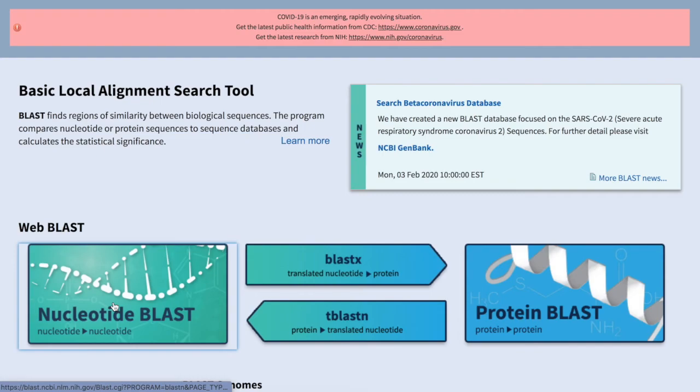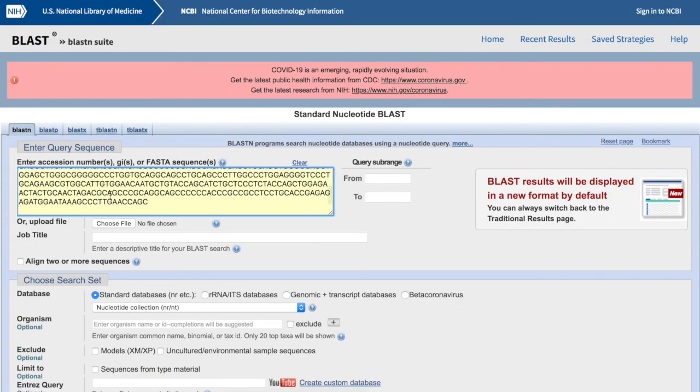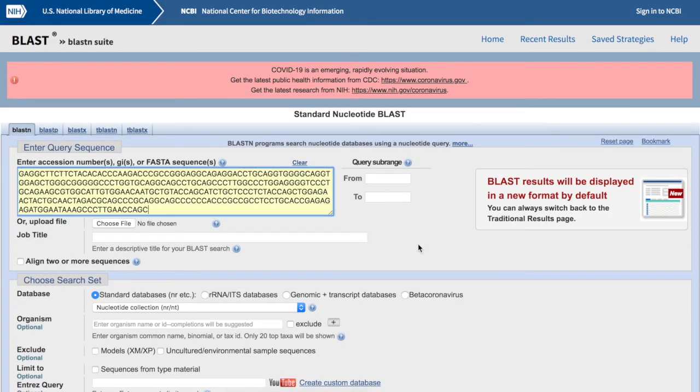To begin, log on to the BLAST website. You don't need a login or a password. Select whether you are using a nucleotide or a protein sequence, then paste the sequence into the search box at the top.